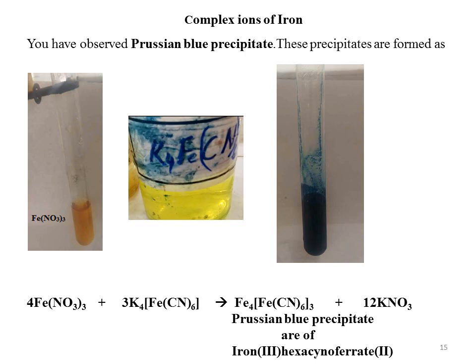That potassium ion, when replaced with ferrous, तो Turnbull's blue precipitate appear हुए थे, वहाँ पर +2 और +2 oxidation state थी product में. But here we are having two different oxidation states in the product complex. Ferric nitrate has plus 3 oxidation state of iron, potassium ferrocyanide has plus 2 oxidation state of iron.